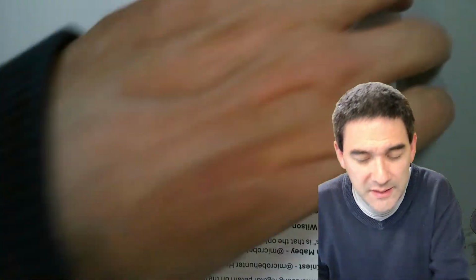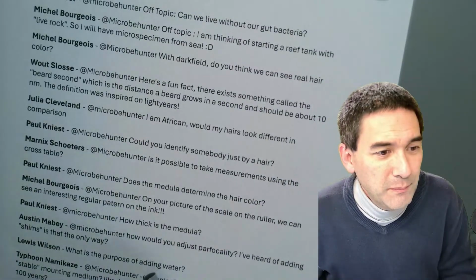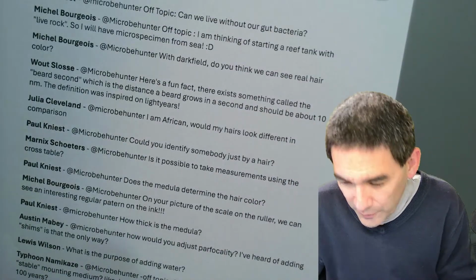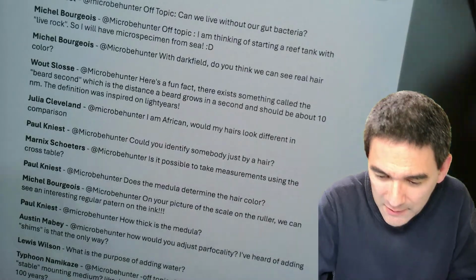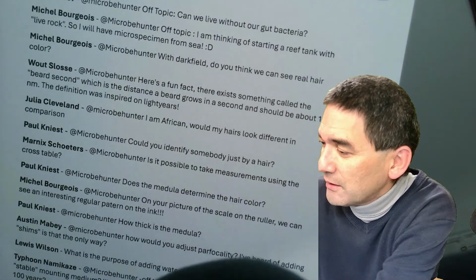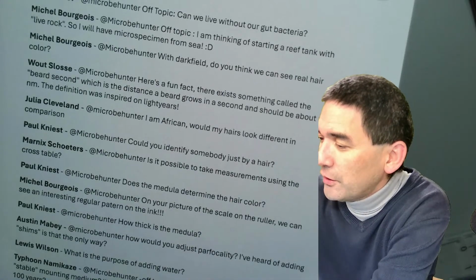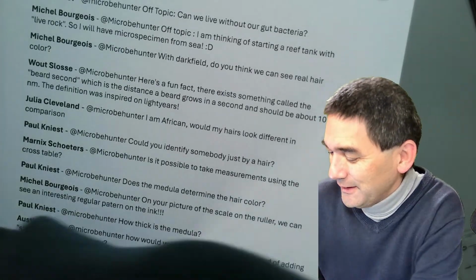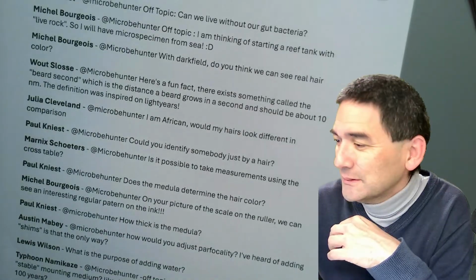I think after almost 1.5 hours again, I'm going to call it quits again. Oh, look, the text is upside down. What we do is the following: just for the fun of it, we're going back to the very beginning. For those of you who missed the very beginning, I put my beard that I shaved under the microscope.